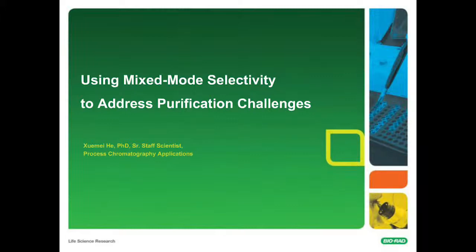My name is Sharif Hanala. I am the product manager here with the Bioprocess Chromatography Group at Bio-Rad, and I will be the moderator for today's session. Now, we hold these webinars every so often when we feel that we have some significant insight that we can share with the industry to help you move your work forward as we work together to tackle the industry's biggest challenges. Today's webinar is entitled Using Mixed Mode Selectivity to Address Purification Challenges.